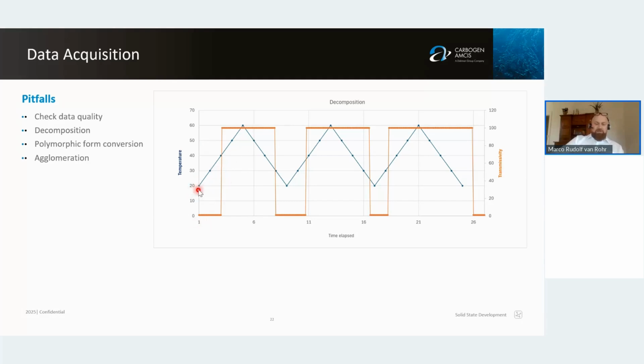As your cell is warming up, at some point you will have a clear point, so your material goes into solution, and at some point it will reprecipitate, typically at a lower temperature. If you warm up again and you see, okay, the clear point is 2 degrees lower, you might already face decomposition, and in a third cycle, it's even lower. Okay, you'll have a problem with decomposition.